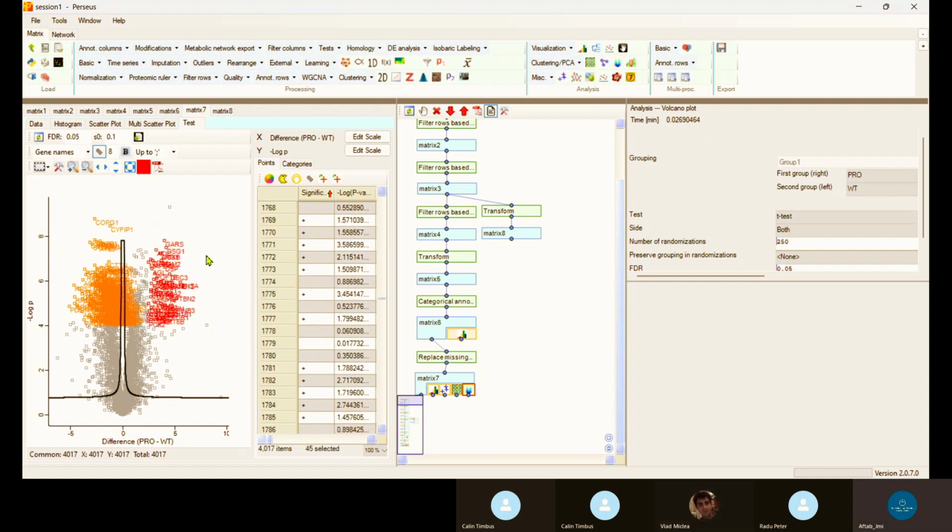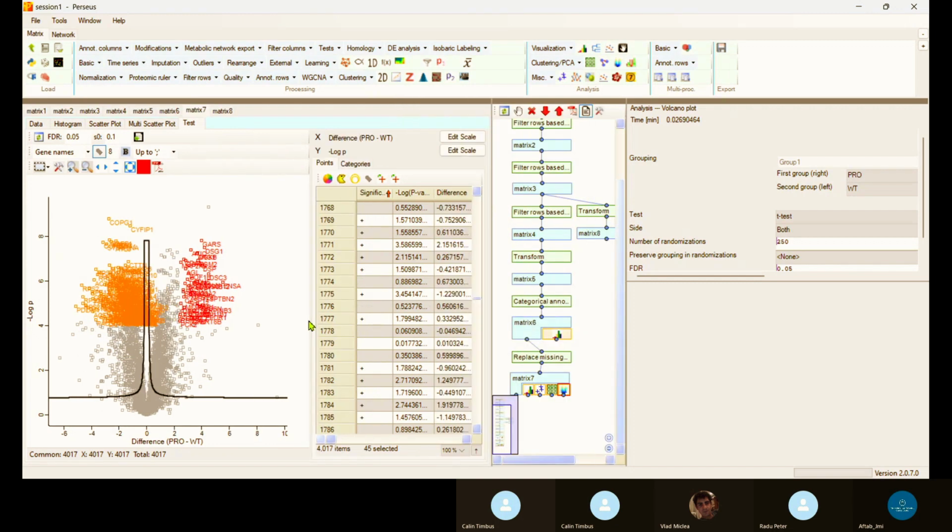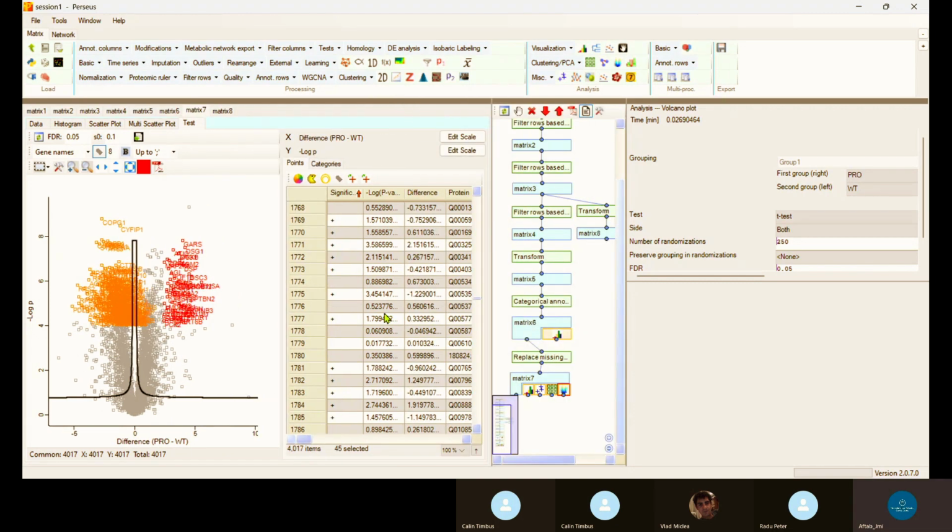So here, same thing we can identify. Now we have a list of significant proteins which are high abundance and low abundance. Now our work starts: take all the proteins from the matrix and make a protein-protein interaction network and highlight these significant proteins with different colors, as I showed in my PPT. Some nodes are green and some nodes are red.